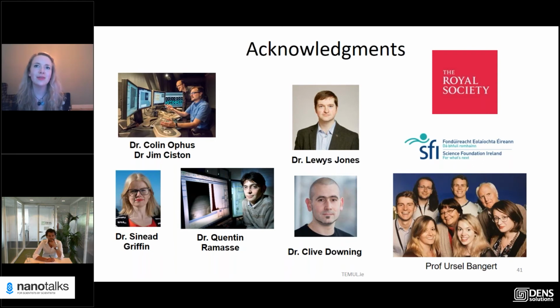So the first thing will definitely be strain engineering. We're looking at single crystals and making these FIB lamellas, but if the strain is related directly to, let's say, the ferroelectricity and whether you get a conducting or insulating wall, then I think it's really important to start looking at thin film growth. So that's what I'll be looking at. And with that, doing the in-situ biasing of thin films rather than just the bulk crystal, because that really is what the device will be.